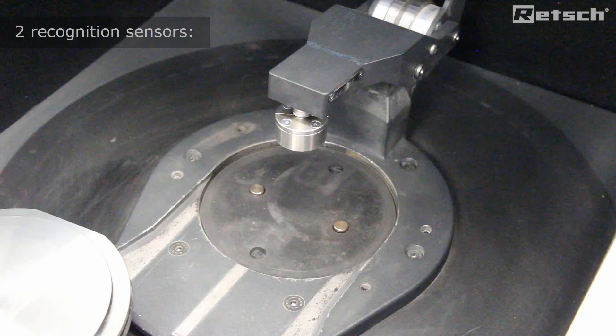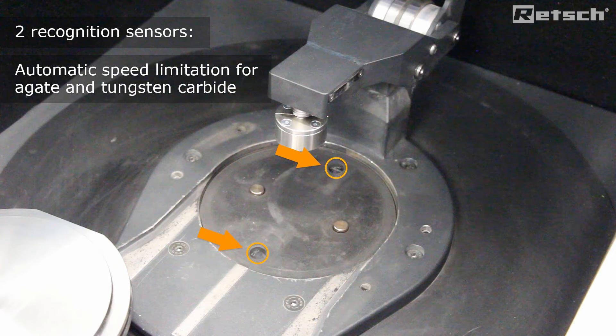The RS200 instrument has two recognition sensors: one for agate, which limits the speed at 700 rpm, and another one for the use of the tungsten carbide grinding sets, which limits it to 1200 rpm.